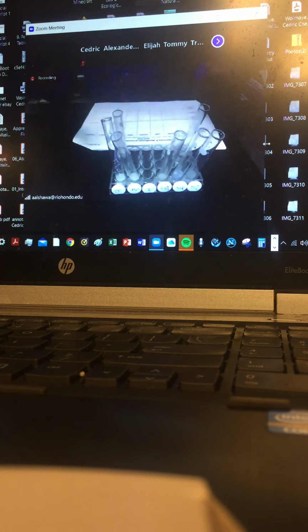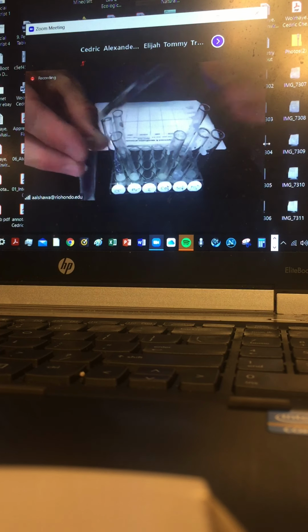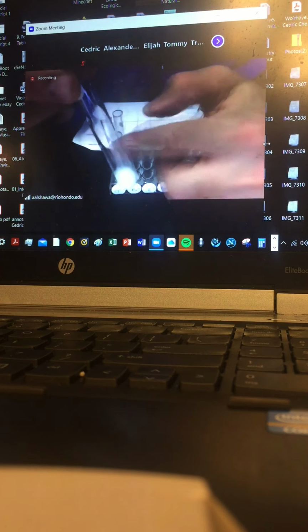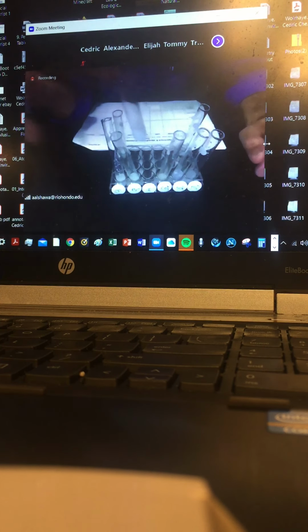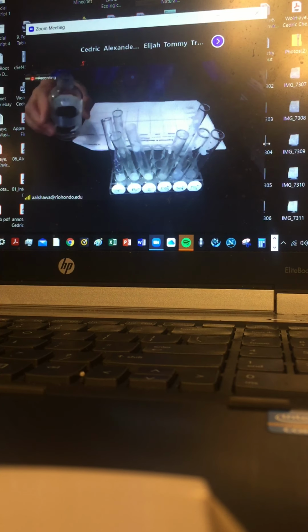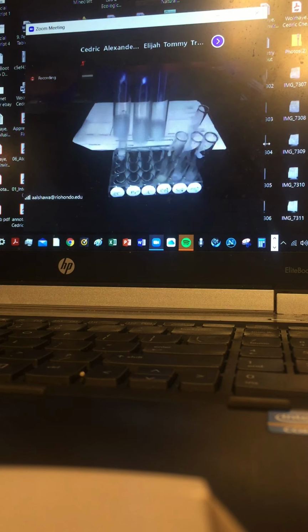Remember, we added a milliliter of iodide, and then I want to add maybe 2 drops of silver nitrate. So that's the outcome with the iodide. After that, I want to add nitric acid. Okay, so this is the outcome upon the addition of nitric acid to the halide.